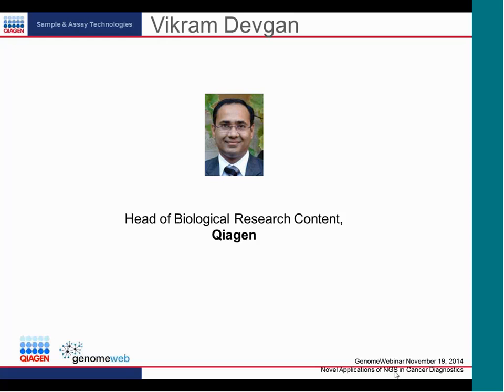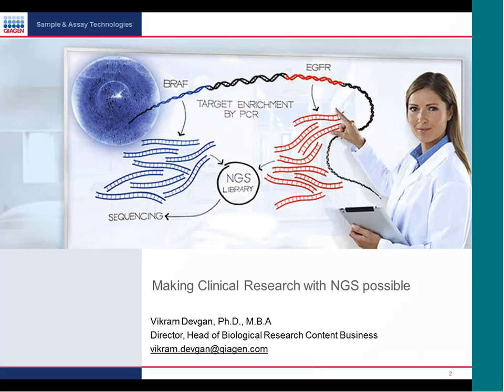Thanks, everyone. First of all, I would like to thank Professor Buttner for providing such a wonderful presentation. You have already heard real-life examples of the applications coming out of QIAGEN GeneRead panels, and not only the panels but also the applications of the QIAGEN Sample to Insight next-gen sequencing workflow. So today I'm going to follow up on what Professor Buttner has said, and talk more about targeted DNA sequencing.